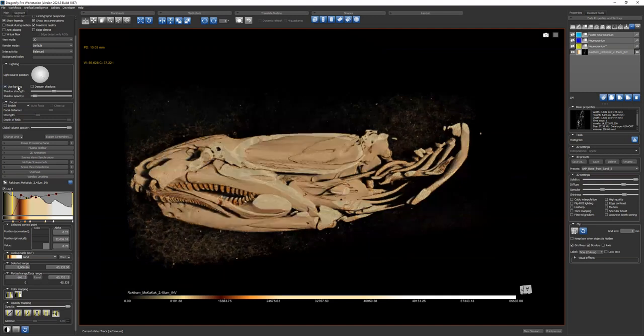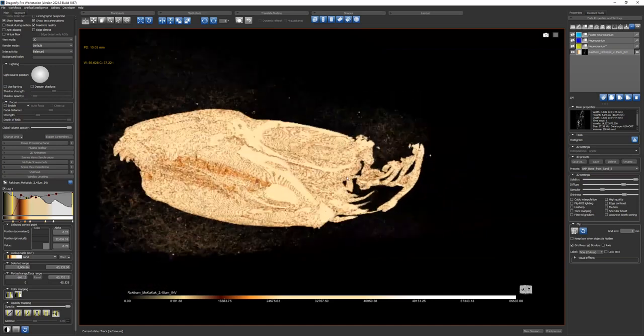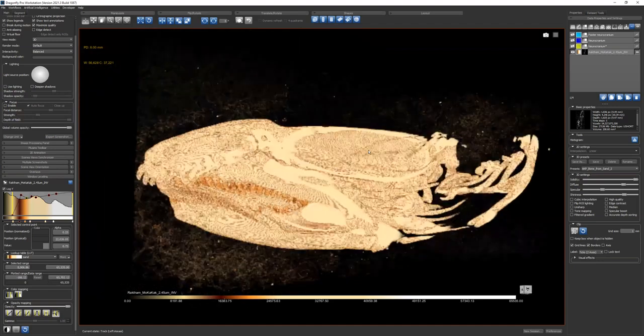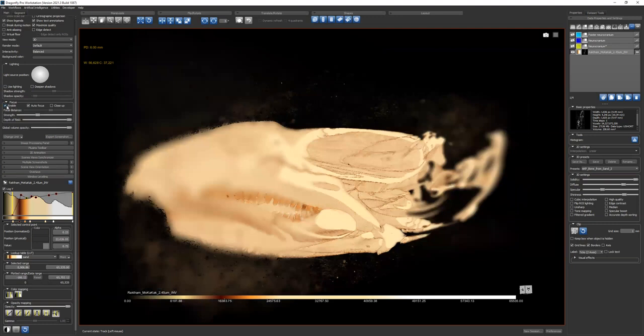But you can also get rid of it. And then it looks like this and isn't as hard to manipulate for the computer. If you use lighting, it is really intensive on the computer. I've never used focus. It's horrible. Not sure why this exists.